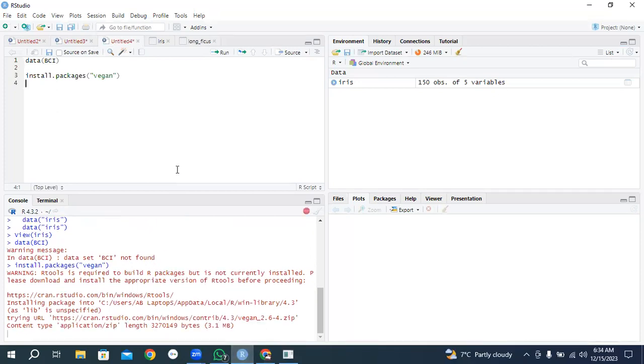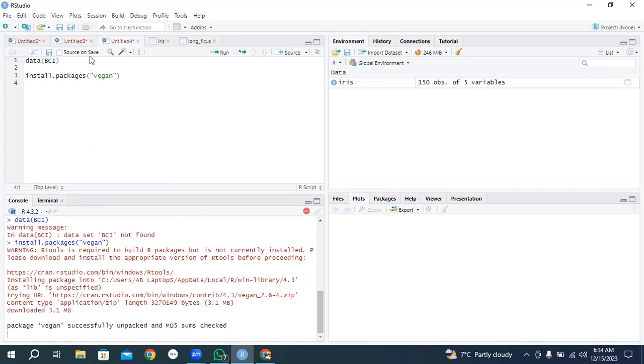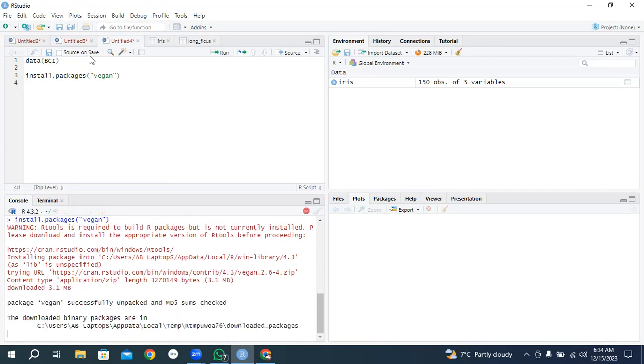Please, Dr. Habibur Rahman, install this package, vegan, and then we move to the next step.